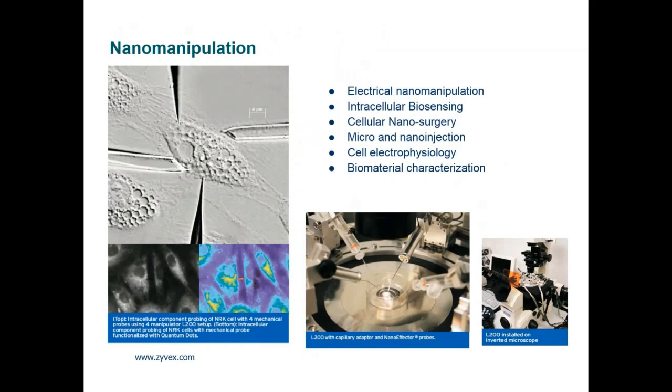Another technique that's very important is nanomanipulation. This can be done basically by using tools to poke, to measure, to surgically, quote unquote, reconstruct. A lot of these nanomanipulation tools, although this is not my expertise, are very important because they allow you to measure and manipulate living cells as observed in a microscope. So a micromanipulator and a nanomanipulator are essential tools. Again, this section just summarizes the importance of the interface and the use of tools to interrogate that method.